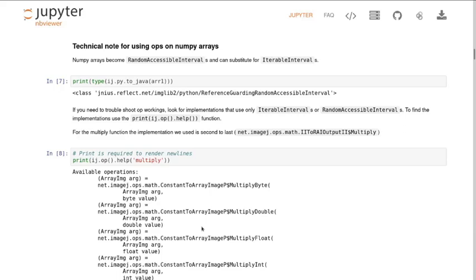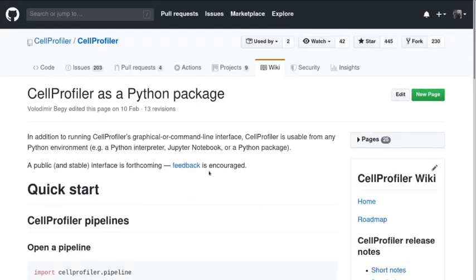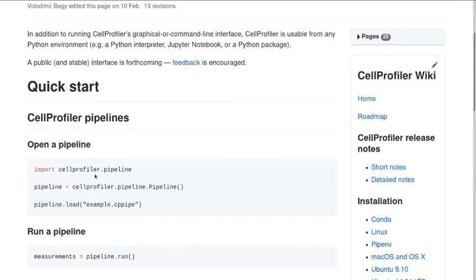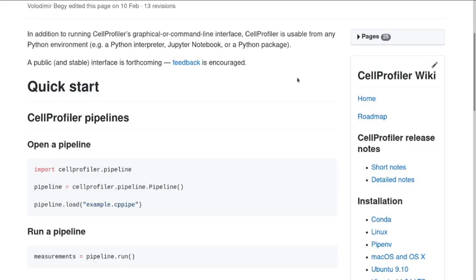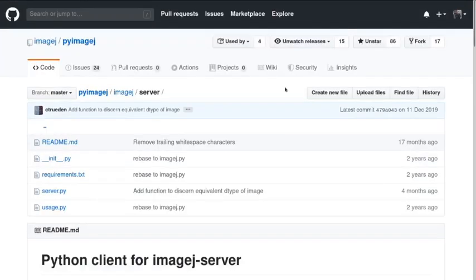It's worth noting that I think you can also interact with Cell Profiler through Python. So if you've got a pipeline that's currently going through, say, a bit in ImageJ and a bit in Cell Profiler, if you have a bit of pre-processing that's in Python, Fiji and Cell Profiler, then it's going to be quite easy in time to create a Python script that saves it all for you from one place. And you can do it all from within the notebook as well, so it's still got that visual environment.